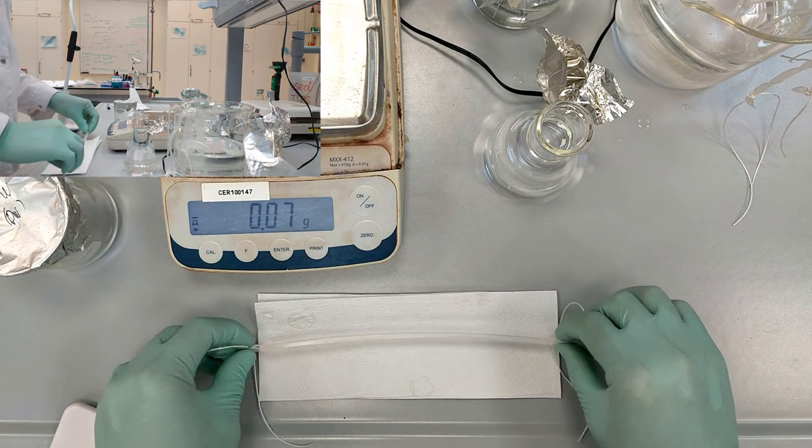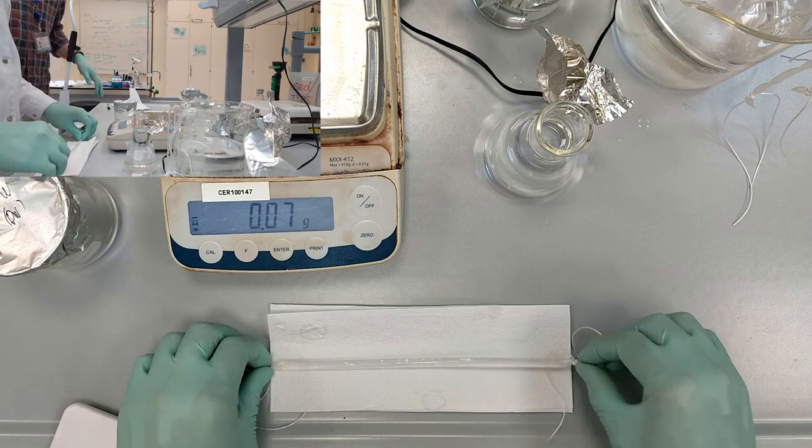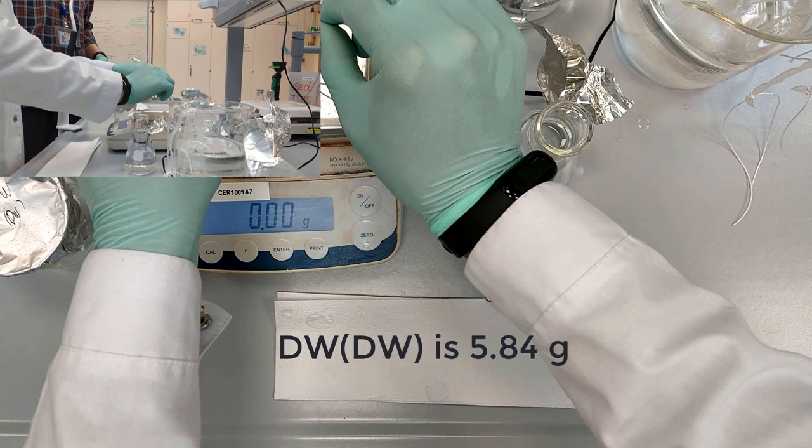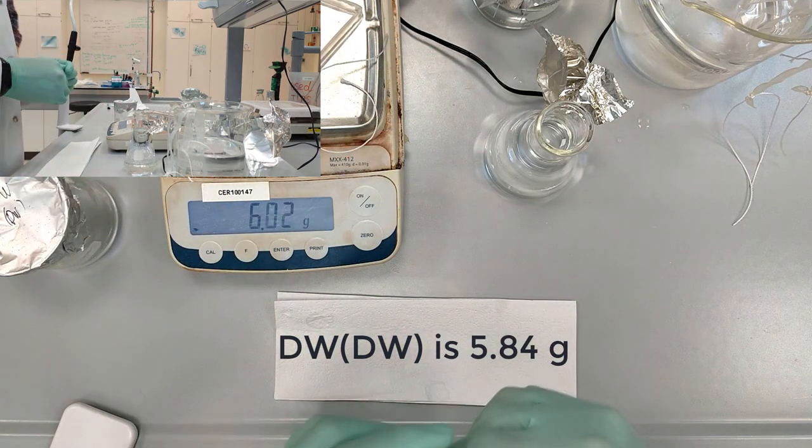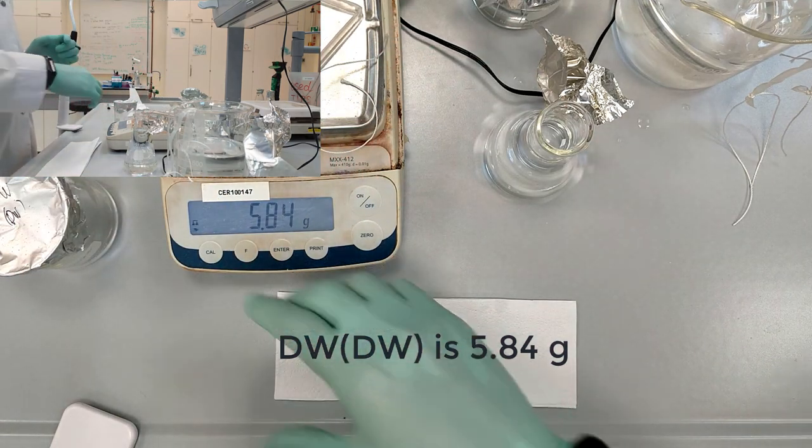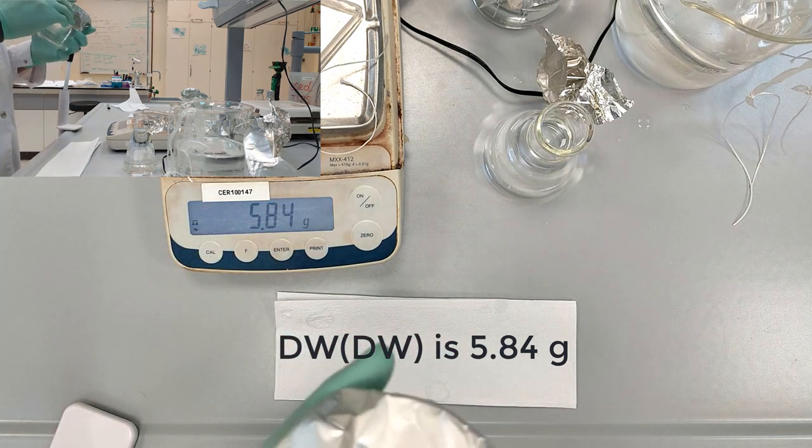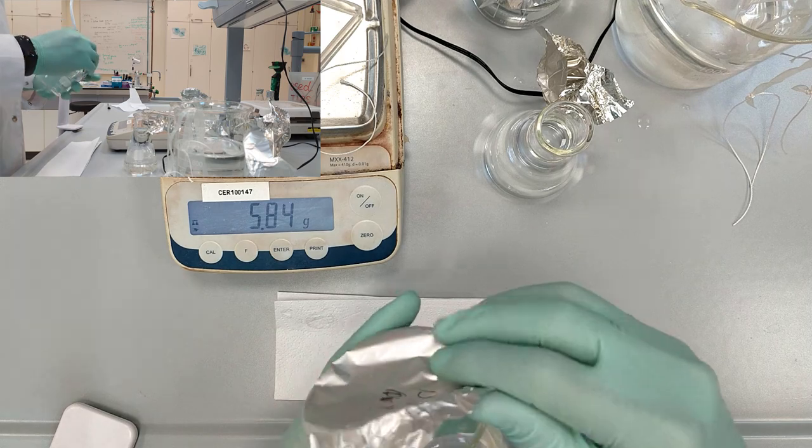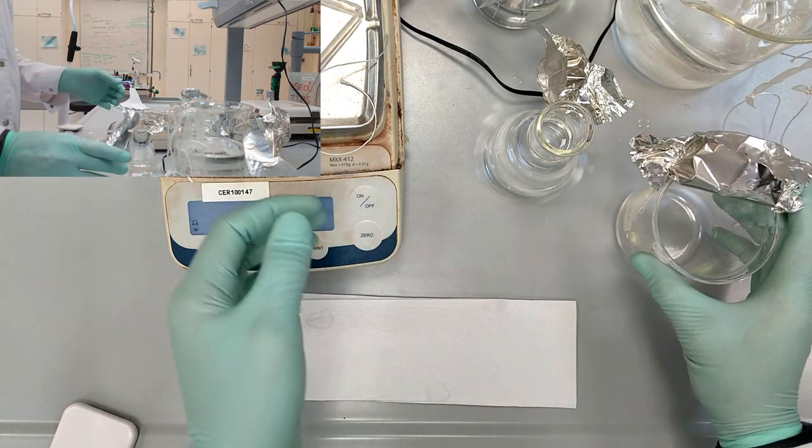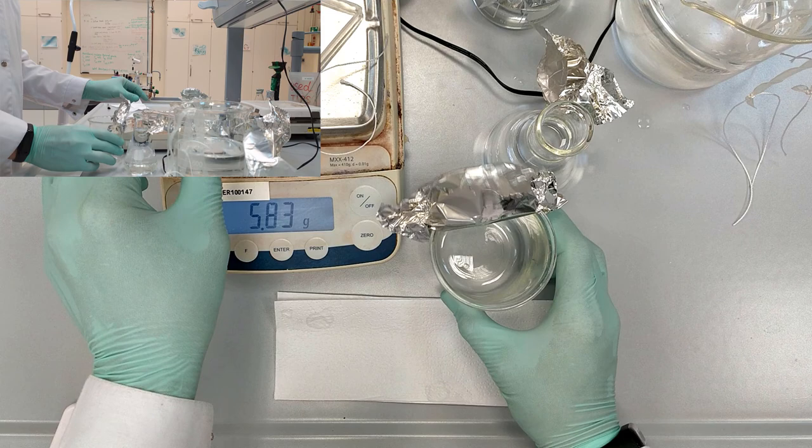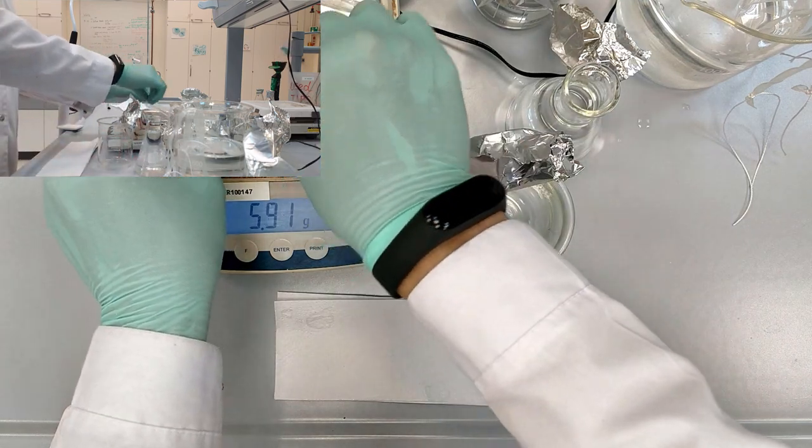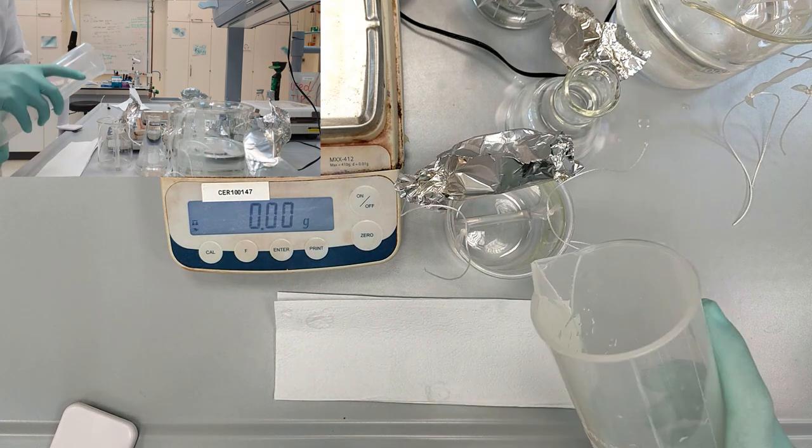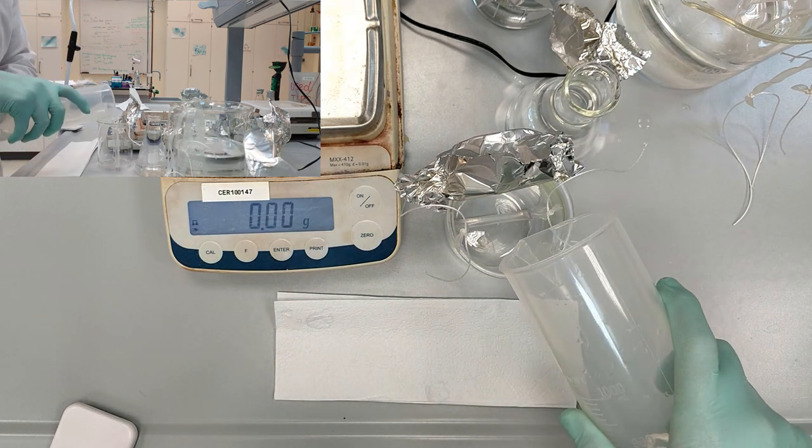After that, put the dialysis tube on the scales. So the mass is 5.84 grams. We are also putting it inside the beaker and pour 200 ml to cover the dialysis tube.